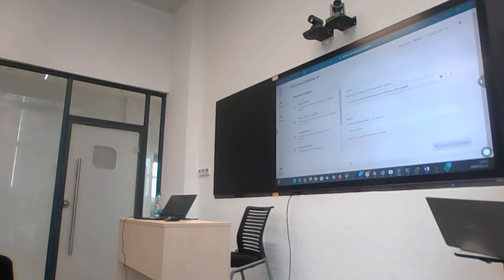Is your thing working again? How? Oh, it opens into the background. Let's see. Okay, now for you guys, there's an extra option for the output, but I'm going to show you in a minute. Okay? So once you've got your output location, okay, everything good? Everything good? No? What's not good?